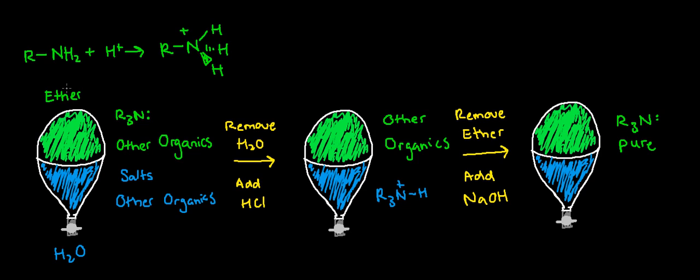So this is something very common in pharmaceutical synthesis. If you've ever done a synthesis like that, you may have actually done it and not even realized what it is you were doing. So it's important to know this because it'll help you maximize your yields and just cut out all the impurities and garbage that you don't want in there.